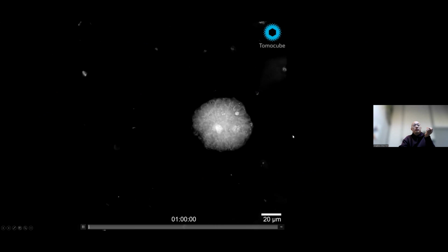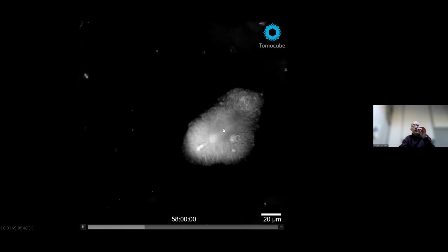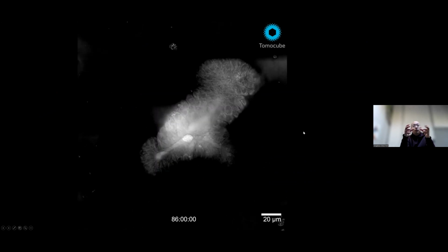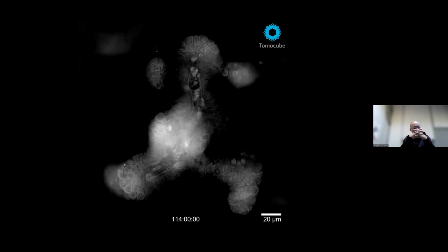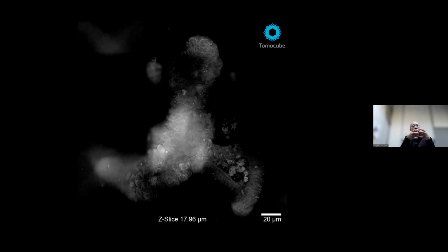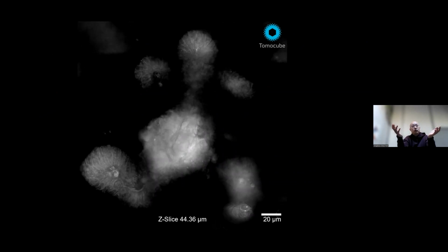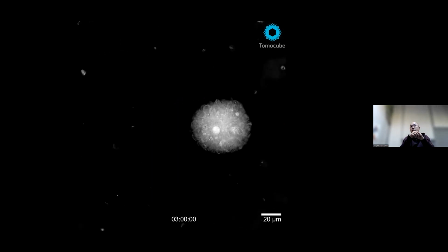We can also measure small intestinal organoids from mouse, and they start from the size of 50 micrometers. And this is another one-week movie. We incubated these organoids in the tabletop incubator, which is incorporated in our microscope. And finally the organoids grow to the size of 150 to 200 micrometers. So you can see the individual cells and their subcellular structures.